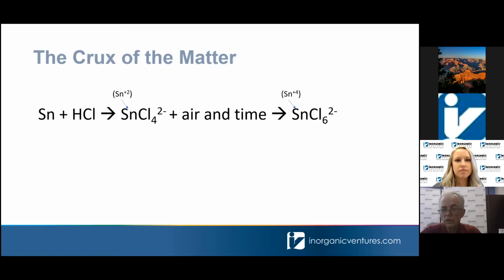For those of you who can't use HF, check and see if you would be allowed to use fluoroboric acid, because we have produced a very high purity reagent, not a standard, that contains HF and is available through the fluoroboric acid approach. The chemistry we're dealing with is not real complicated, not a lot to remember, but boy, it can sure cause a lot of headaches. Thank you, Autumn. Thanks, Paul.